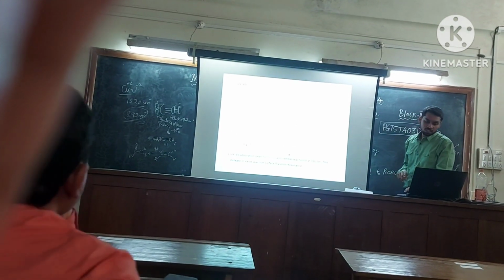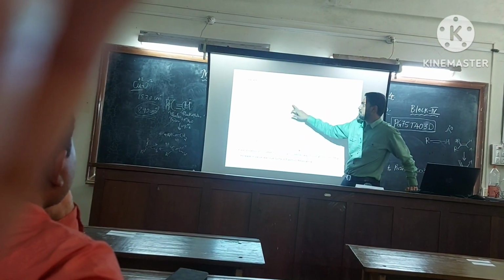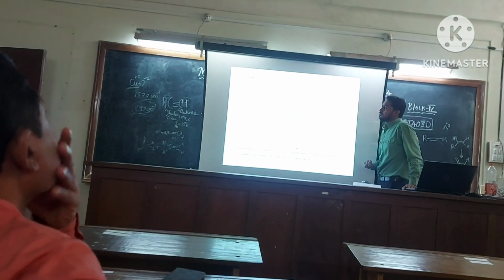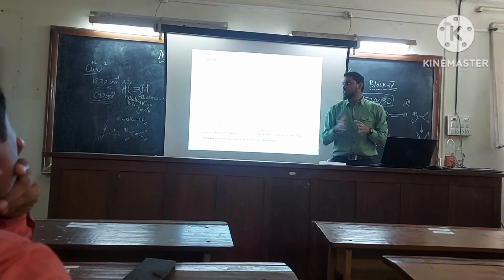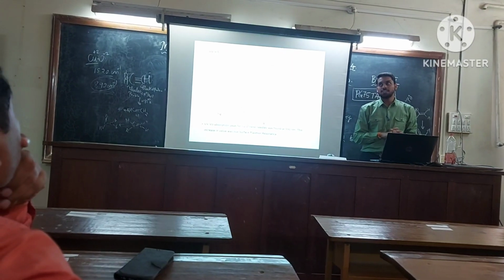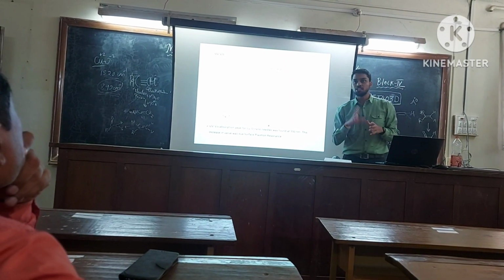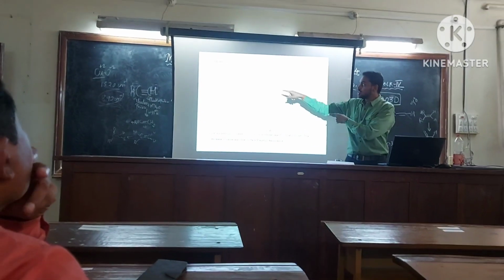This is UV. We have got the lambda max, the highest absorption peak, at 550 nanometer. When we took the UV spectrum for the leaf extract, at that point of time it was around 320-330 nanometer. But now when we got the nanoparticles, we got it at 550.